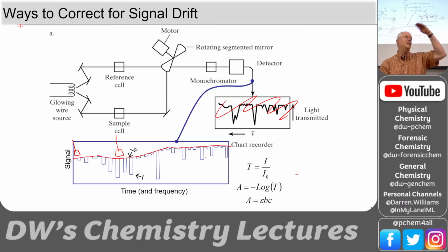And so the source is as bright as it can be. Okay. And then during that time, we've chopped the sample cell in there. You know, we put it in and it's kind of bouncing around and then it stabilizes. And so we get a measurement of I when the chopper is sending it through the sample, and we get an I naught when it's sending it through the reference cell. And it's tick, tick, tick, tick, tick, tick, tick. And we tell the computer, take the average of the I naughts and the I's and get a nice stable ratio. Okay. So that's what we would have.